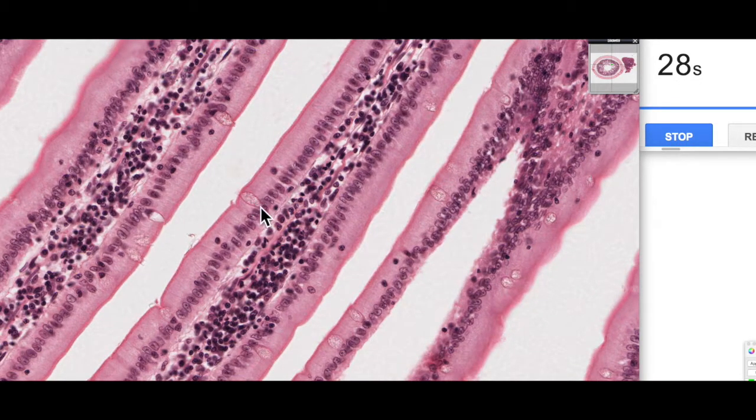If we zoom along here, here's a goblet cell. You can see its nucleus here, but this region of its cytoplasm is relatively unstained. That's because mucus has lots of sugars on the protein backbone which masks the protein from eosin and hematoxylin. That's a good take-home message for goblet cells.